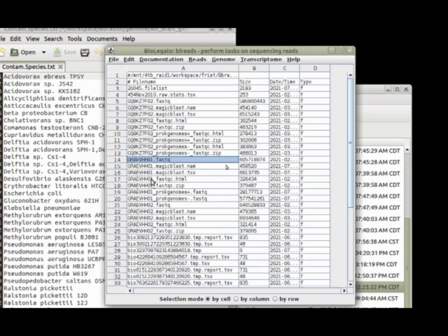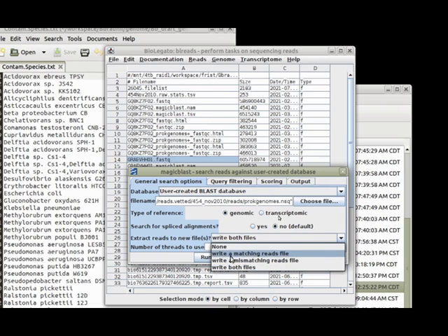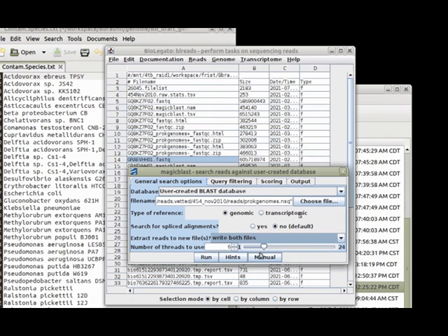So now that we have that database to search, we can take any fastq file or set of files for that matter and run Magic Blast against our user-created BLAST database. So here we just select any of the files from the BLAST database, and in this case it will write two files. One file will be sequences that match the contaminants, and others will be sequences that don't match the contaminants. And so when we run this, we'll get output for both possibilities.